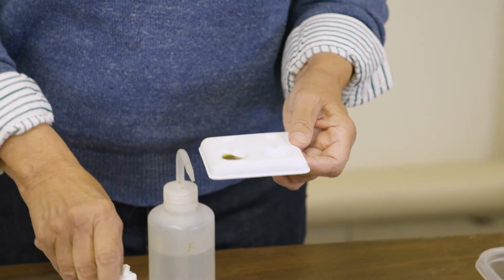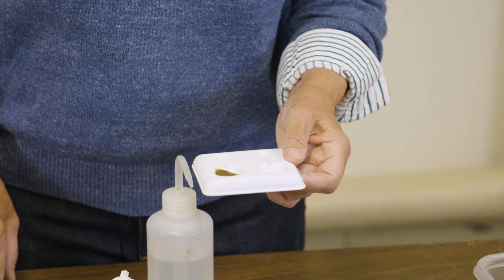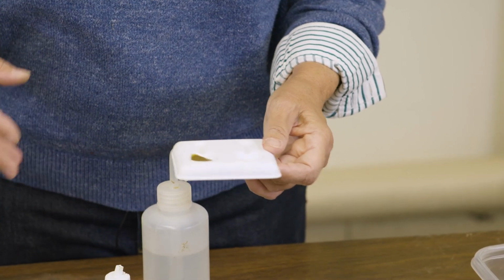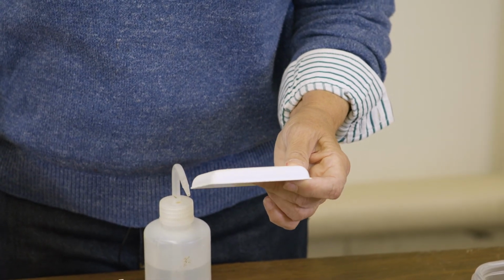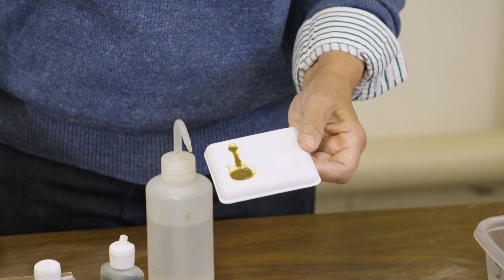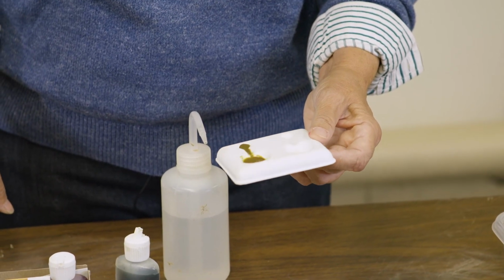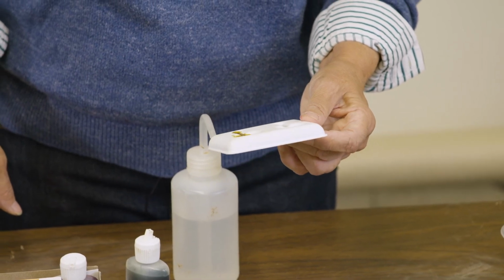We're going to mix this for about 10 or 20 seconds so that the reagent mixes with the soil. And then we're going to allow that solution to go down the channel. In this case, there's quite a bit of soil there, but I can still see a color. Well, what we're looking for is the color in the channel.